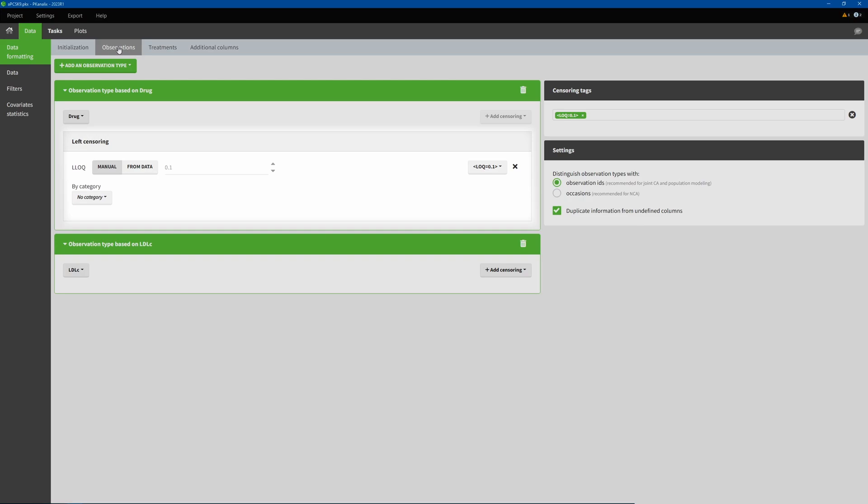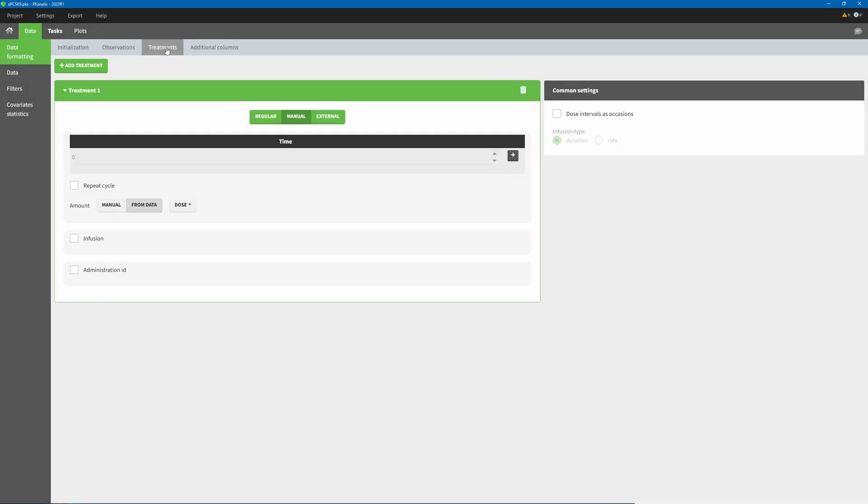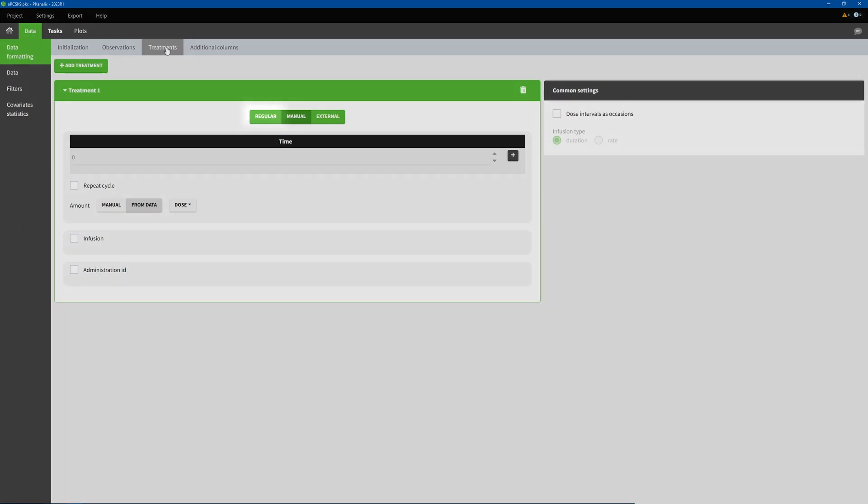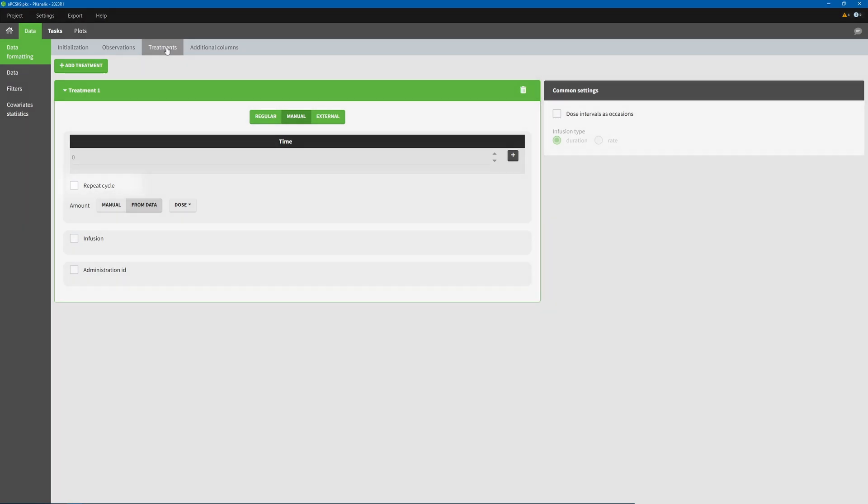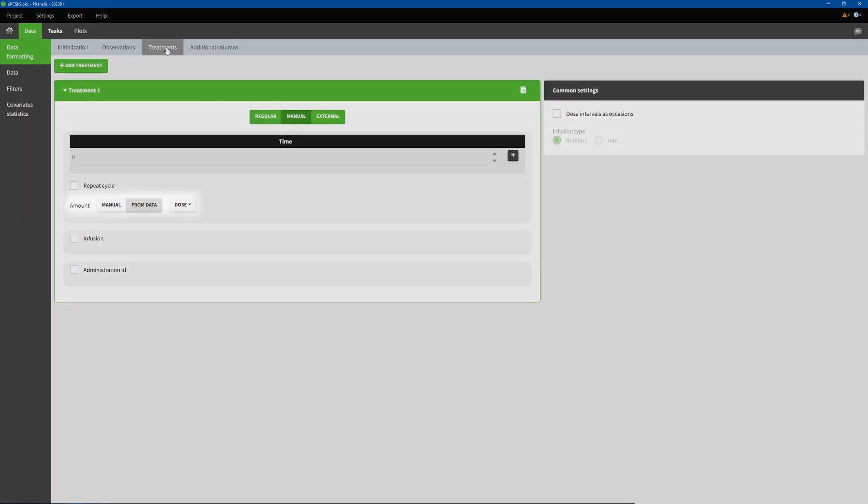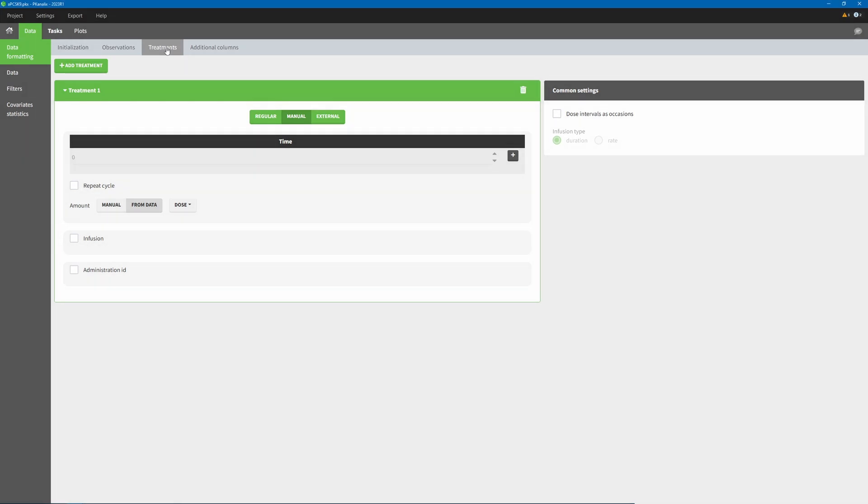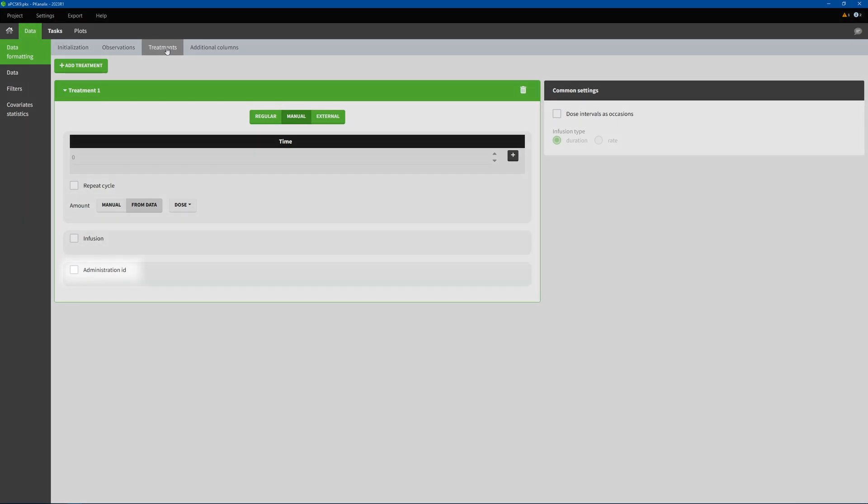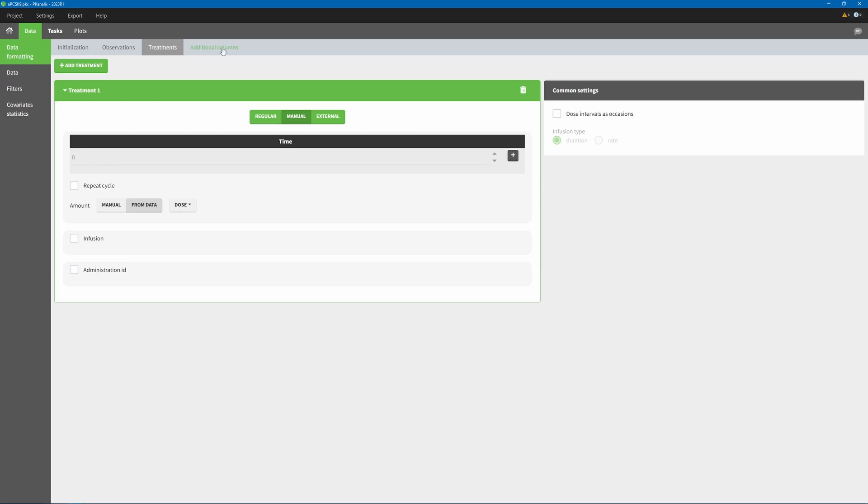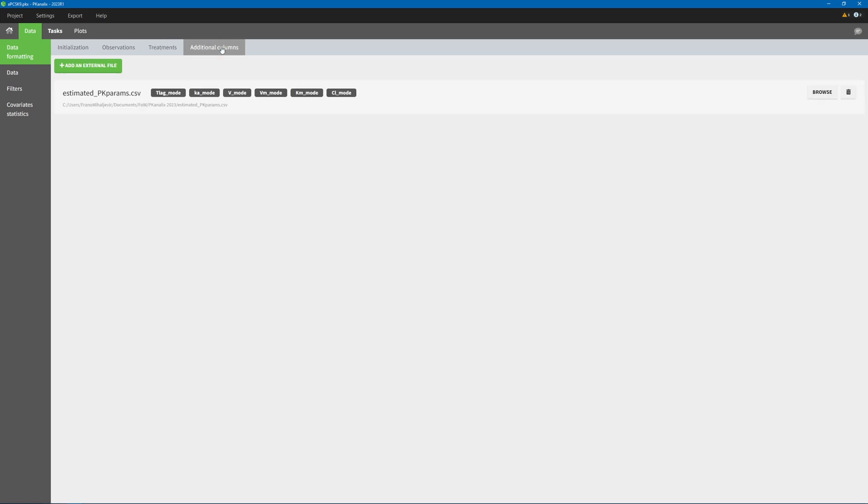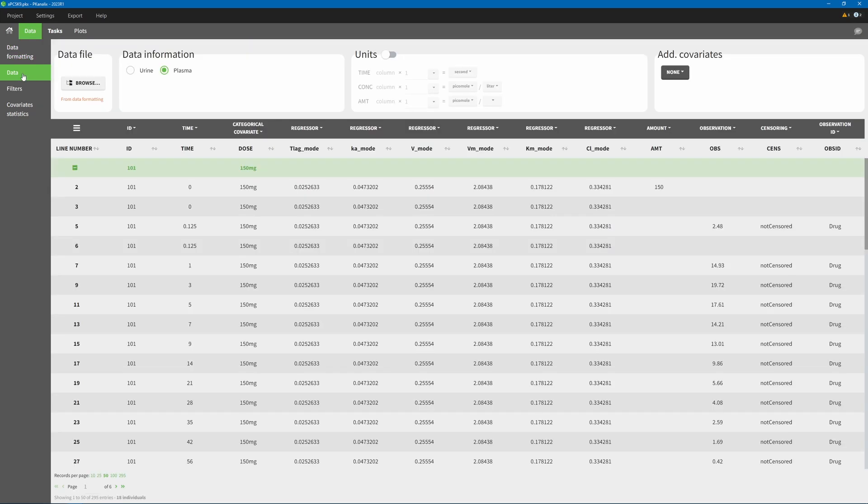Add censoring information based on BLQ tags, add treatment information from an external file or specifying it manually with a variety of possibilities such as multiple doses, repeat cycles, amount read from a data column or given manually, infusions, combined therapies, or dose intervals handled as occasions. And finally, add covariate and regressor columns from another file. You can see the formatted dataset in the interface or export it as a new file.